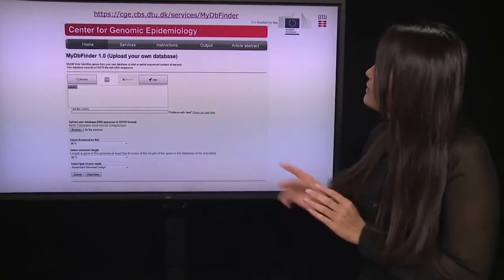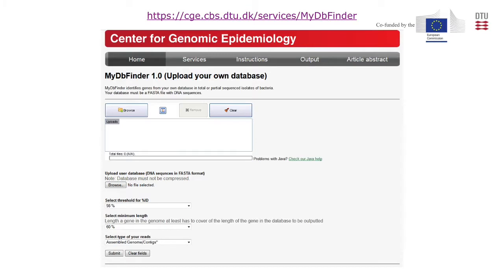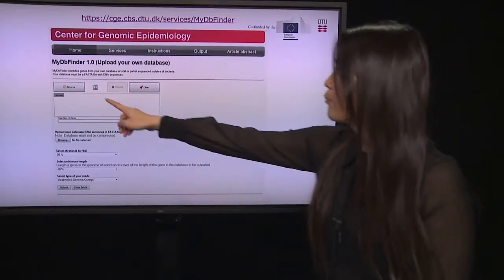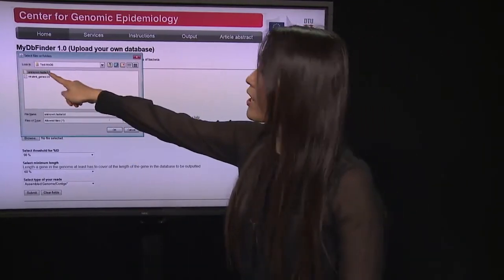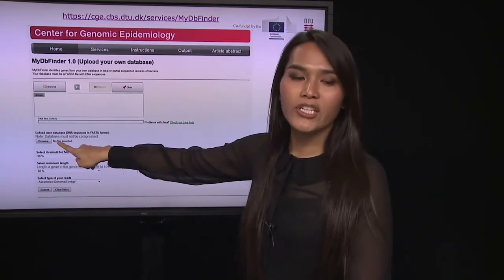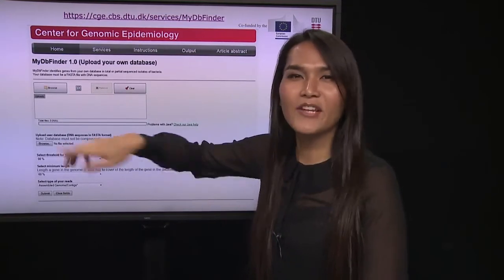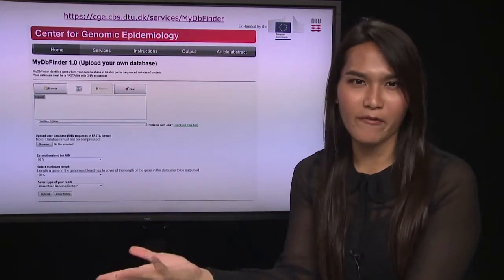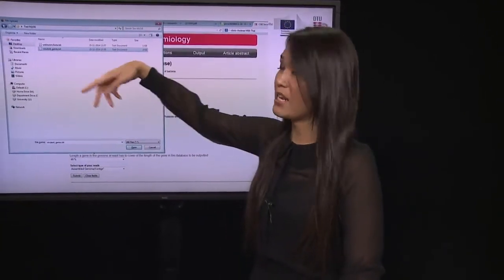This is the web link to MyDB FIDER. When you click it, you see the web interface. First, you browse your unknown sequence and upload it. The next option is to upload your own database — the one you made in the text editor. In this example, it's a virulence database.